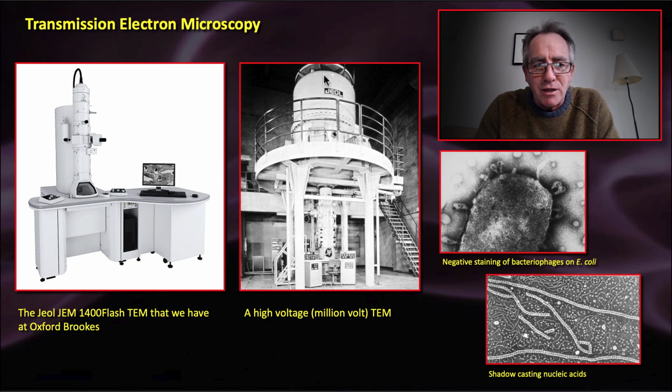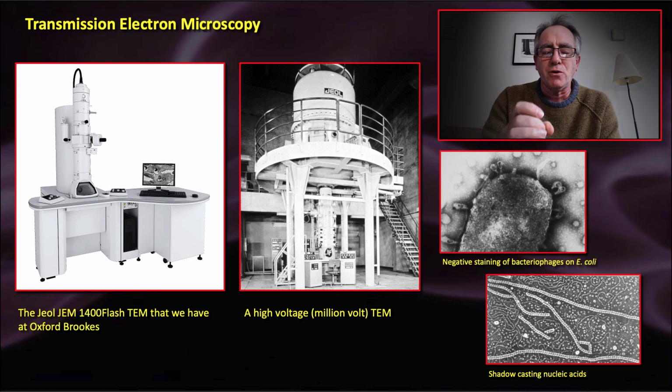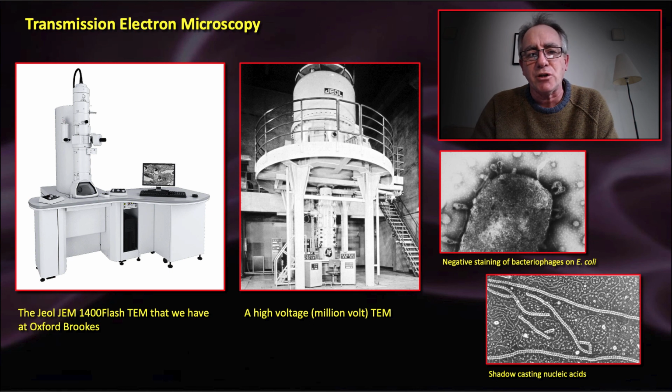The electrons accelerate from up here down through a little specimen. The higher accelerating voltage gives you the possibility of higher resolution and greater magnification. It means that they're able to go right down and image macromolecules, tiny, tiny parts of DNA. Look at the structure of the individual nucleotide bases where they join with each other.